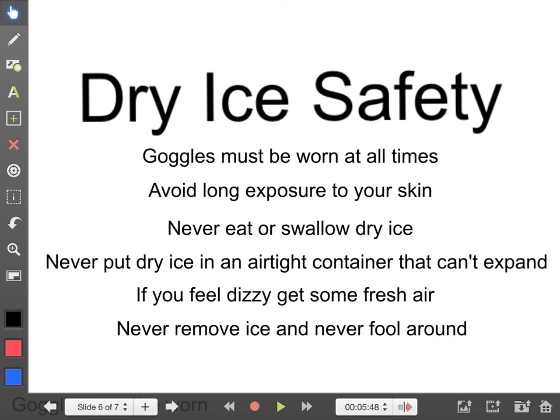It's not going to kill you or anything, but you should probably go somewhere where there's fresher air, near the back door, where you can open the door a little and just get a quick breath of air, or you could walk out of the classroom for a second or two. I will be ventilating the classroom, so this shouldn't be a problem, but I just want to make you aware of it.